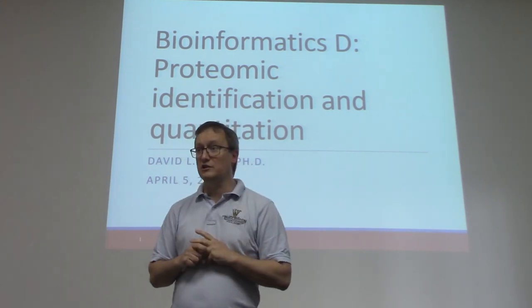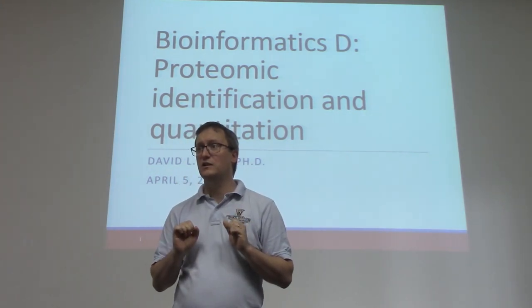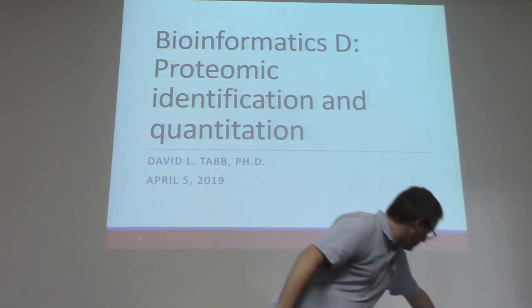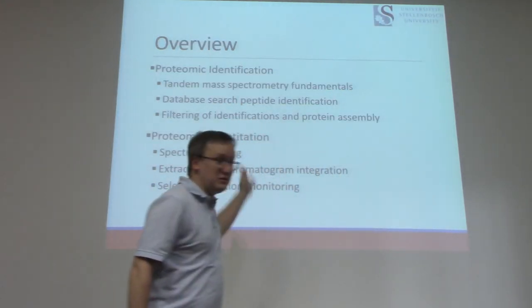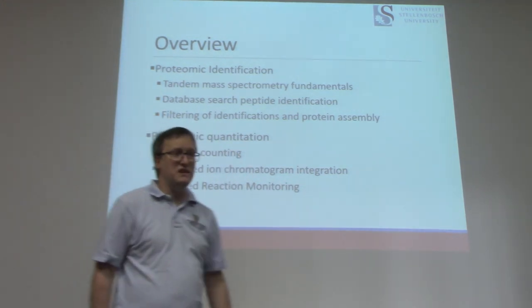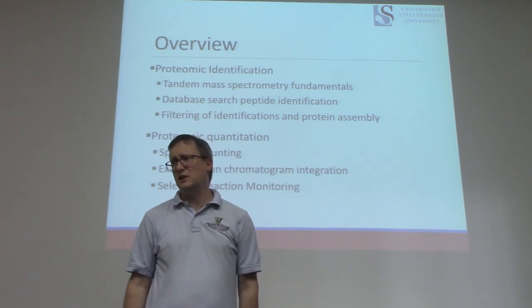And so long as we've got enough time in the 90 minutes we have assigned, we will talk a fair bit about quantitation as well. So as you see, it splits into the identification side and the quantitation side. We're going to start with fundamentals of tandem mass spectrometry.